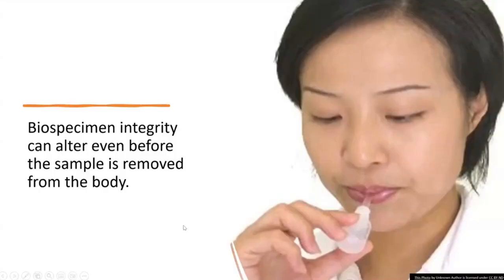So it's important to remember that the integrity of your biospecimen can alter even before the sample is removed from the body. A good example of this is many, many years ago when we first started collecting saliva as a biospecimen. We would have participants chew on something in order to initiate the saliva production.